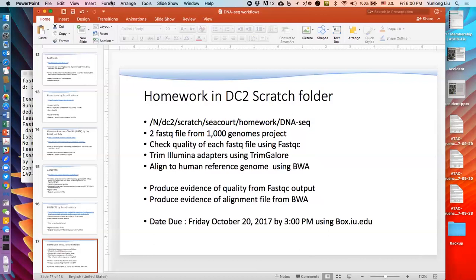If it will run too long, you submit your job and take the time. My recommendation would be to follow up on that. FastQC, since I've shown you the command, is brief and rapid.